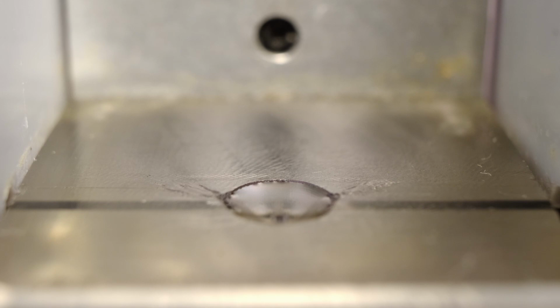After a time, we remove the liquid using a vacuum, so the mouse only has access to it while our sound cue is playing. While the mouse is consuming the liquid, their individual licks are recorded, which gives us lots of information about their consumption habits.